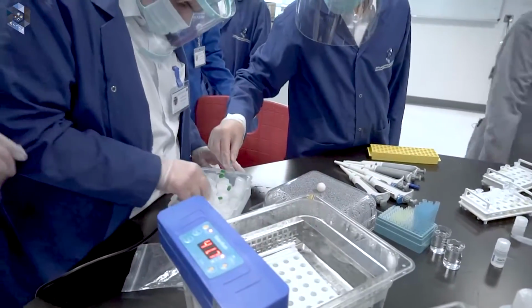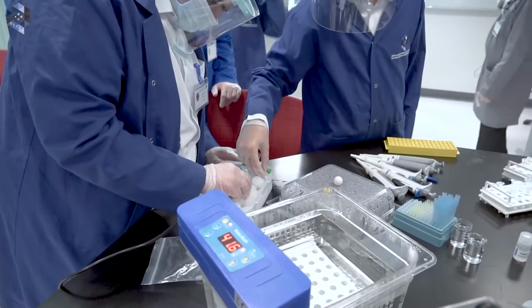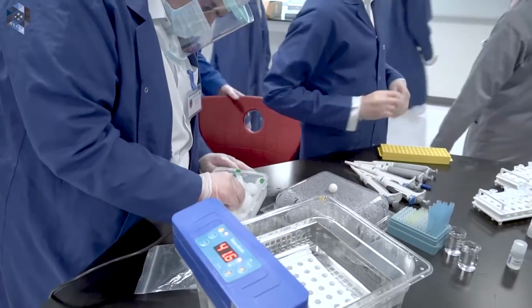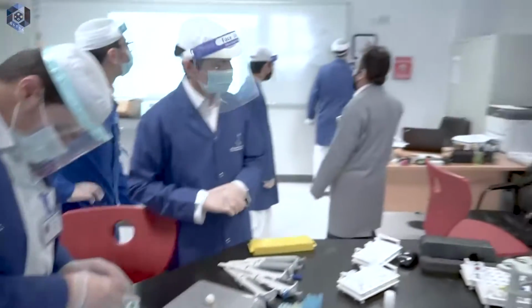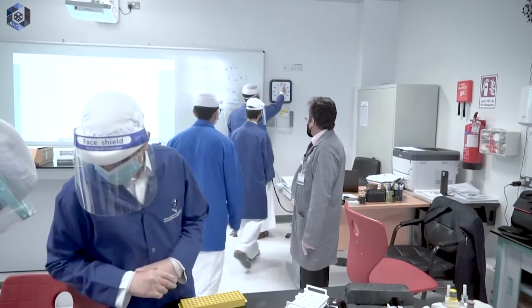Place it in the ice bucket for 2 minutes. Measure the time. 2 minutes.